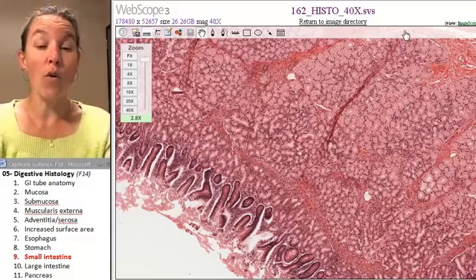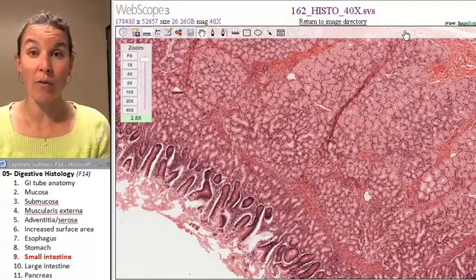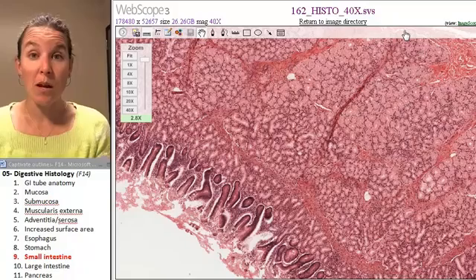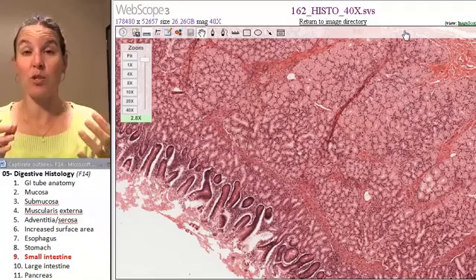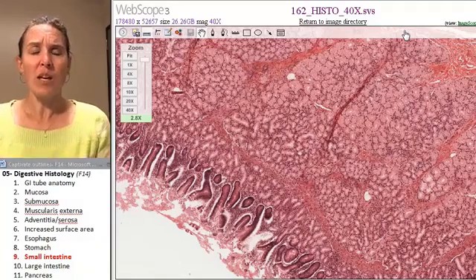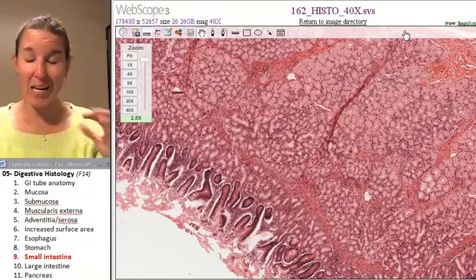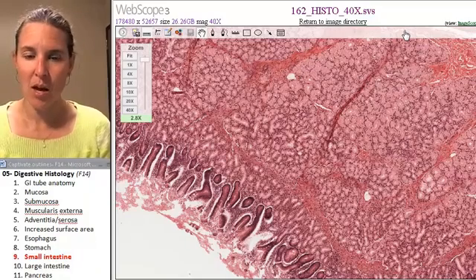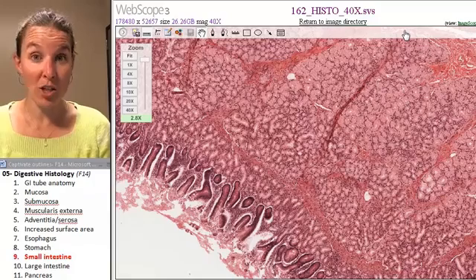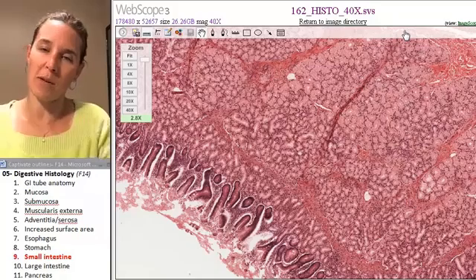They're all over the digestive system. In fact, lymphatic nodules are part of the immune system. It's almost like a little lymph node type structure, and your lymphocytes hang out there. And in fact, I think 80% of all of your lymphocytes hang out in your digestive system because they're making sure that, who knows what you ate, especially if you're my smallest child.